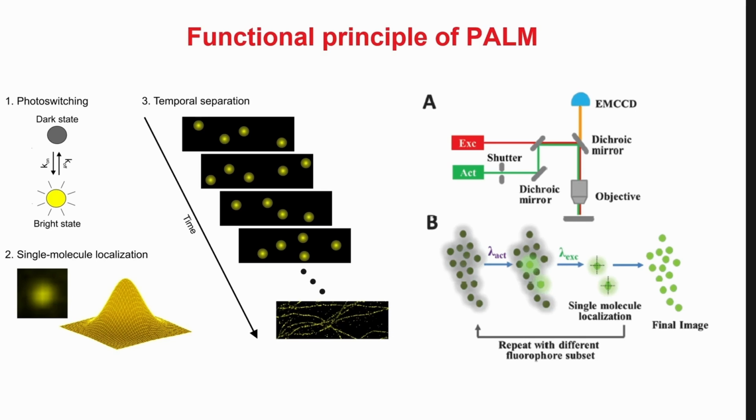So this means that by recording molecules flashing singularly, I will get these individual spots, and they are all big. They are all diffraction, but they are far from each other. So if I keep taking images, and in each image I only have a few molecules flashing, at the end I will have the whole sample resolved at high resolution. Now, how many images do I need to get this image? A lot, thousands. So this is not a fast method.